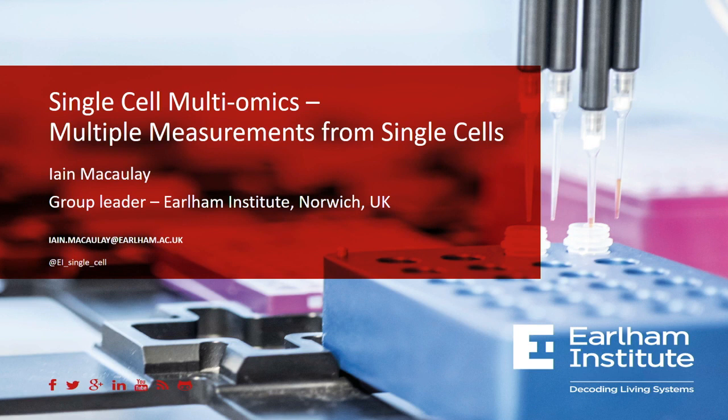So I'm going to talk today a little bit about some of the work we and others have been doing about developing single-cell technologies that allow us to look not just at the transcriptome of a single cell, but to integrate that data with other levels of information from the same single cell.